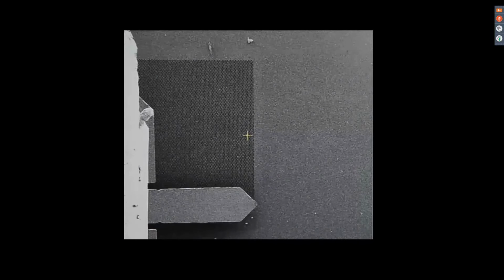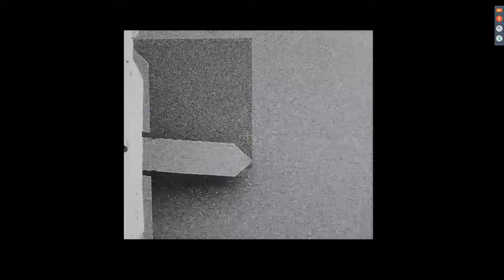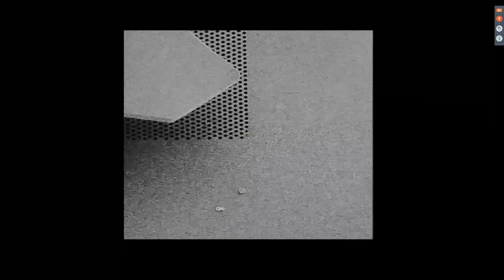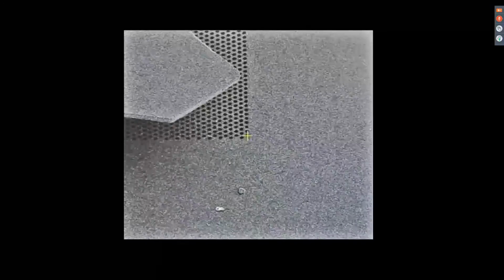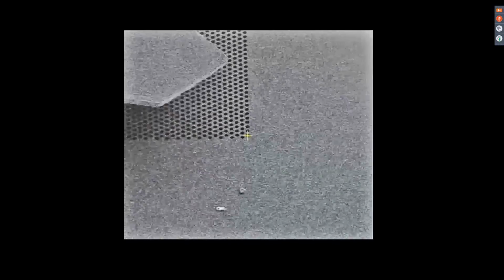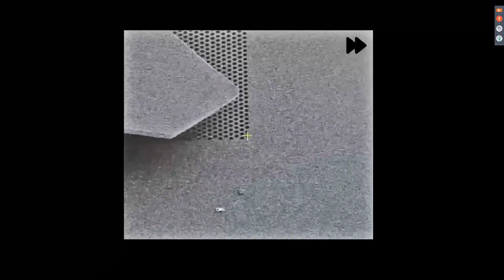To make positioning even more comfortable, we can now tilt the SEM stage to gain tip view access. Thus, we can directly visualize the tip during the approach of the cantilever towards the sample surface. Here you can now see the automated calibration procedure for the X and Y sensors, which are used for closed-loop operation. Following this procedure, we start the approaching process.